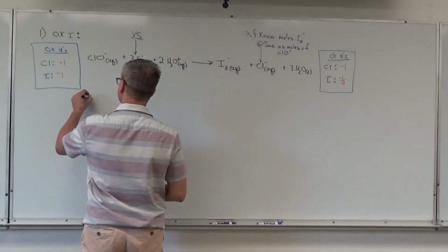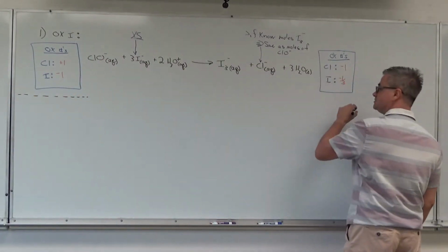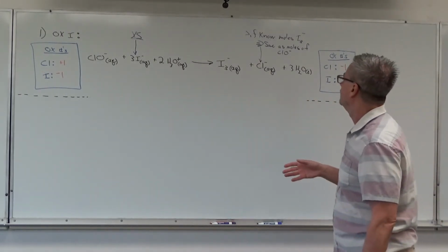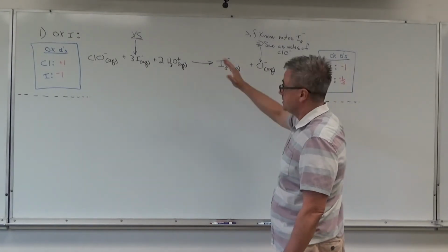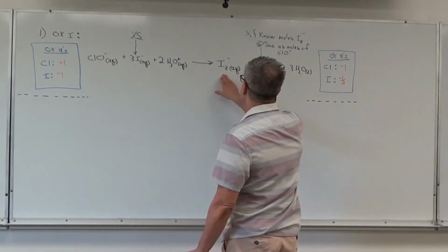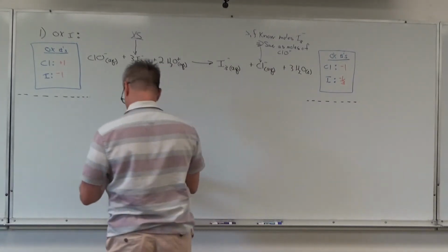So now we're going to see whether we can use a titration. Can we use a burette and somehow determine how much triiodide is in there? You can do that very conveniently by reducing it with a reagent called sodium thiosulfate.